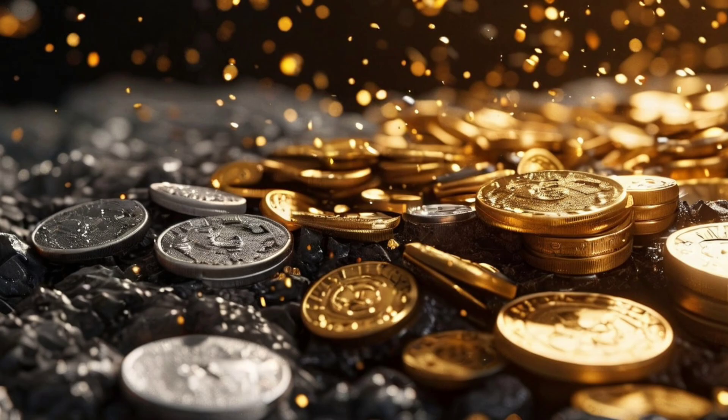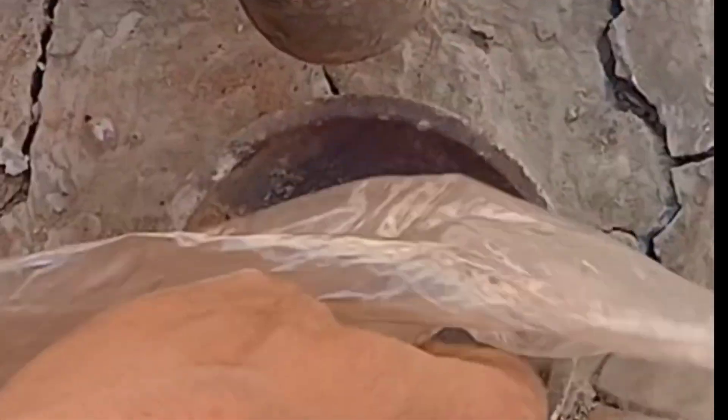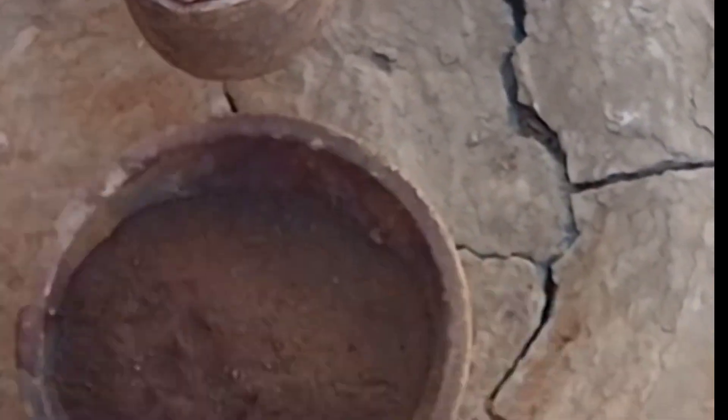Ever wondered how we determine the amount of gold, silver, and other precious metals hidden inside rocks? The fire assay method has been the trusted technique for centuries, known as the gold standard for metal analysis.